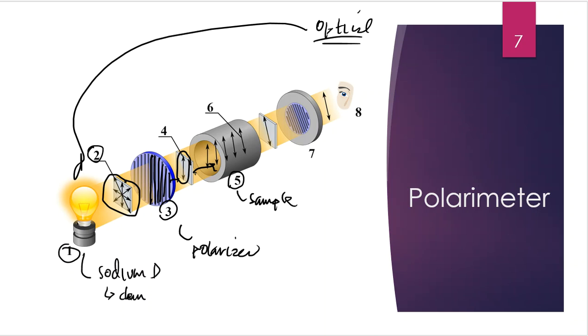All right, so anyway, the reason that this polarizing lens here in the front is important is because this gives us one direction, and this one direction is up and down. Oh, so tick, tick, tick. We start to see that rotation that begins to happen. So out the other end, once it goes through the sample, this is a new orientation of the light that escapes that tunnel that has my sample on the inside.